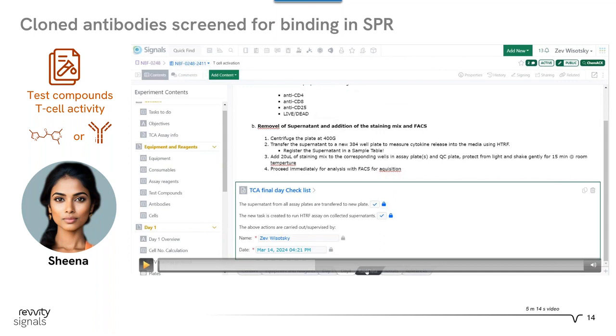in the remaining product demonstration, we'll capture the raw output from the FACS instrument, and it's important to call out that whichever instrument you use, whichever flow cytometry instrument or FACS instrument you use, Signals data capture is instrument agnostic. And what I mean by that is that it's okay that you use many instruments or that they're different. We can support the data capture piece.